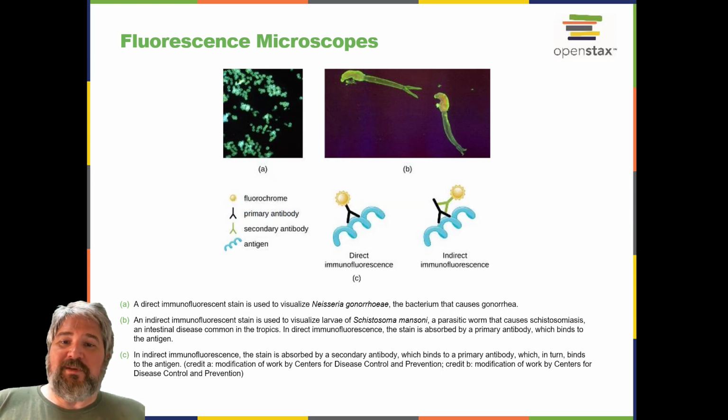The microscope transmits an excitation light, generally a form of electromagnetic radiation with a short wavelength, such as ultraviolet or blue light, towards the specimen. The fluorochromes absorb the excitation light and emit visible light with longer wavelengths, or the fluorophores. The excitation light is then filtered out, in part because ultraviolet light is harmful to the eyes, so that only visible light passes through the ocular lens. This produces an image of the specimen in bright colors against a dark background.